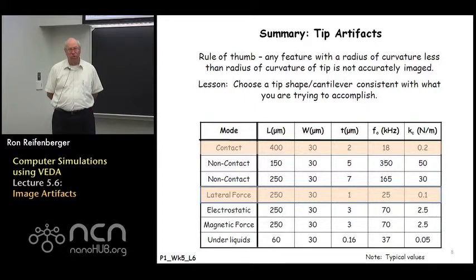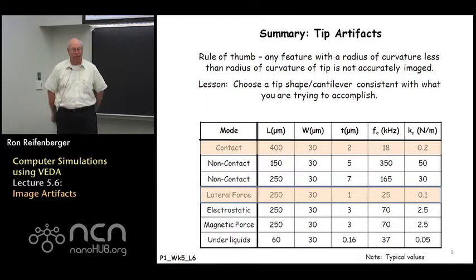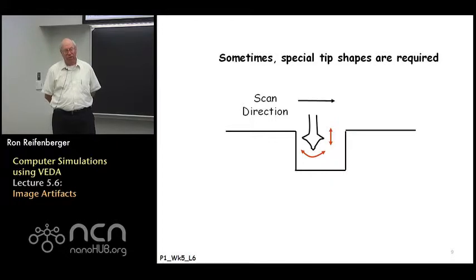When you move into dynamic AFM, there's a much wider variety of cantilevers and tips that you can choose from. And of course, that's one reason why part two of this course has been designed. You'll go into the criteria for selecting a cantilever in dynamic mode AFM. It's a little bit more complicated than in contact mode AFM. I'd also like to mention that sometimes special tips are required for special jobs.